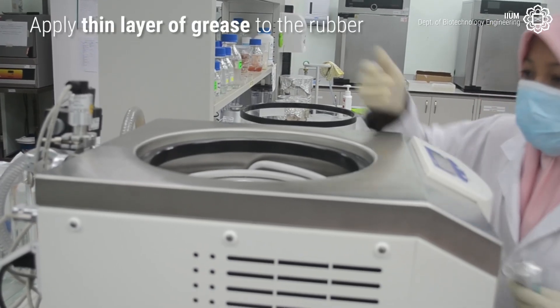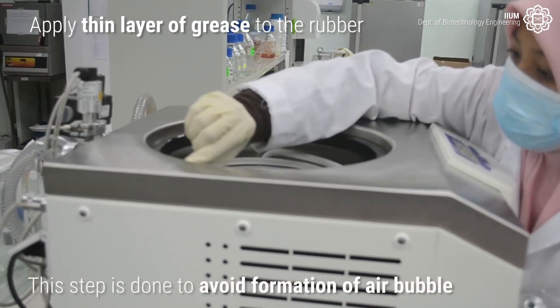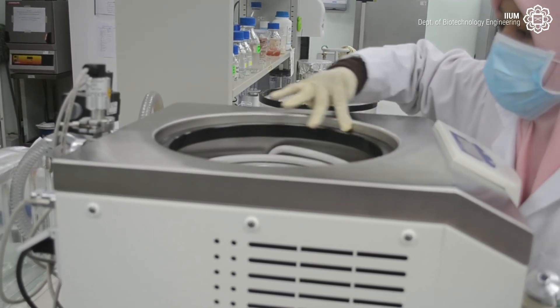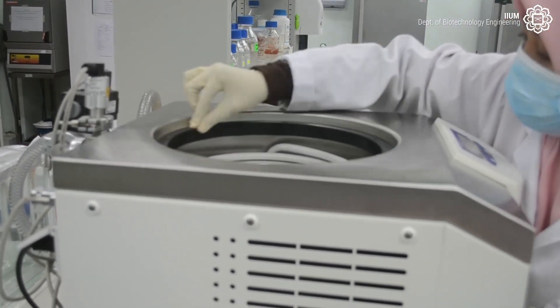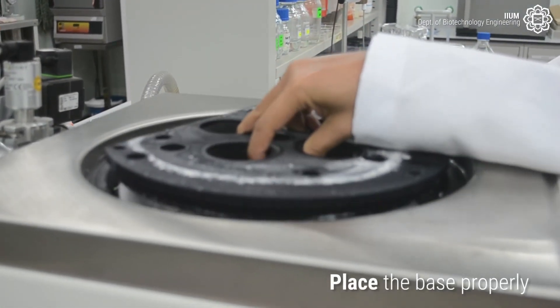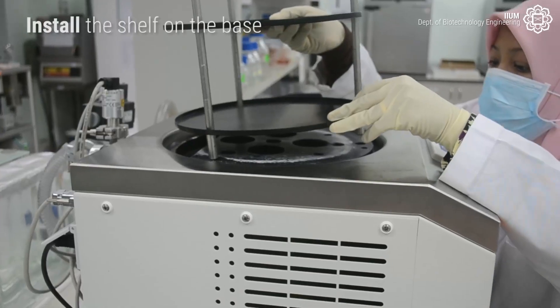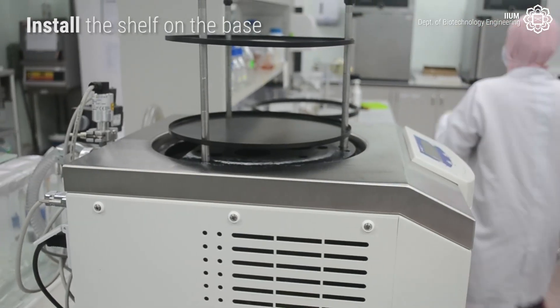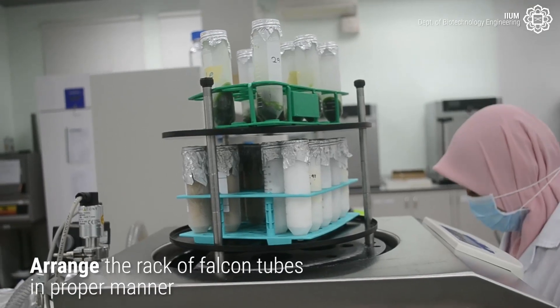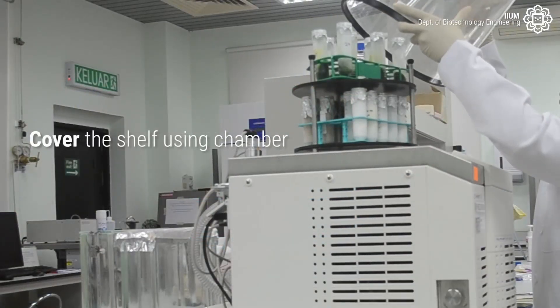Then, apply a thin layer of grease on the rubber. This step is done to avoid the formation of air bubbles. Place the base properly, install the shelf on the base, and arrange the rack of falcon tubes in a proper manner. Then cover the shelf using the chamber.